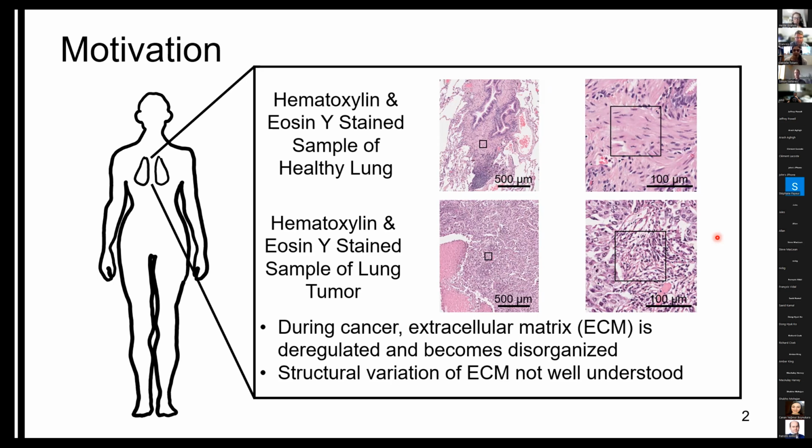And therefore we developed a technique, polarization-resolved SHG microscopy, to investigate collagen structural changes resulting from tumor initiation in human organ tissues, as a method to complement standard histopathology, like what you see here, for improving the accuracy of cancer diagnosis. So today I will discuss our most recent polarization-resolved SHG findings from tissues, as well as work that we are conducting to understand the ultrastructural differences that we see in the diseased tissues.